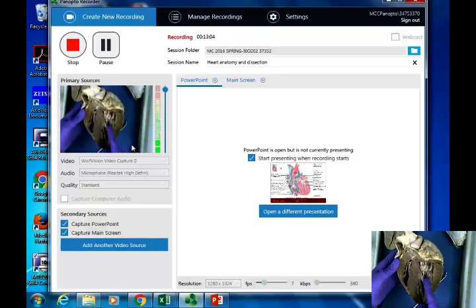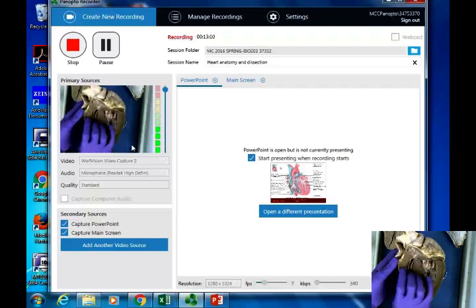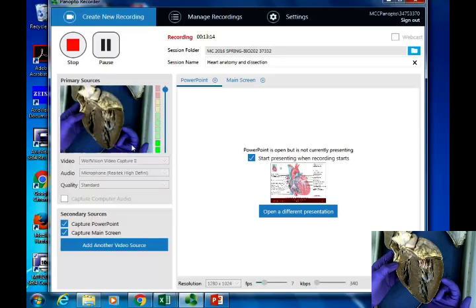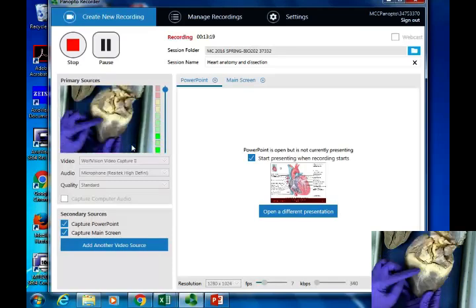So what ventricle is this? It's the thick wall. That's the left ventricle over here. That's the right ventricle over here. So if that's the right here, and that's the left, this is actually the posterior of the heart. So we're viewing it anatomically right now. Okay? That means this is the posterior.